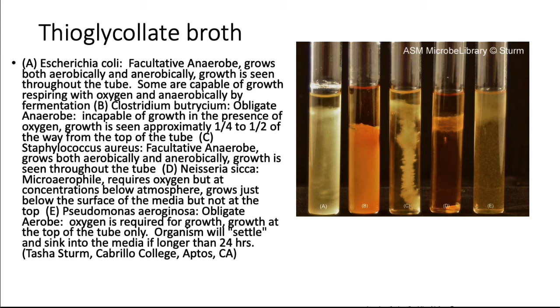Well, in real life, for this kind of experiment, you would use a special broth called the thioglycollate broth. Thioglycollate broth contains a chemical that can capture oxygen. So in the very bottom of the tube, or inside the broth, the environment is quite anaerobic. And it has a little bit of agar in it. It's not a lot. It's not a solid medium, but it provides a little bit more thickness to the gel.